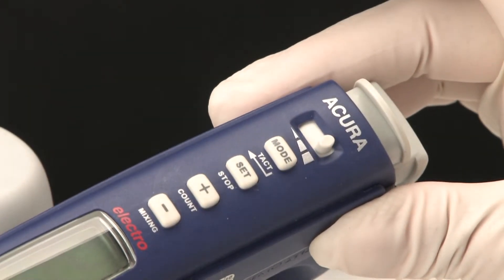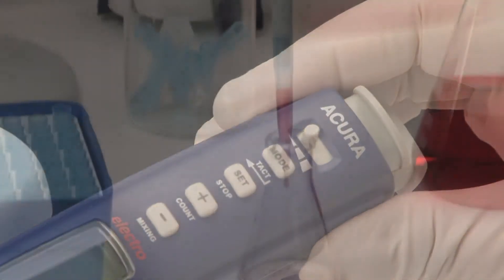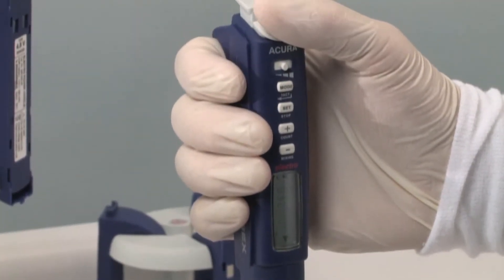Located on the front side, the speed selector allows for swift changes even while pipetting. In addition, slow speed is accessible at any time by a gentle touch of the start button.